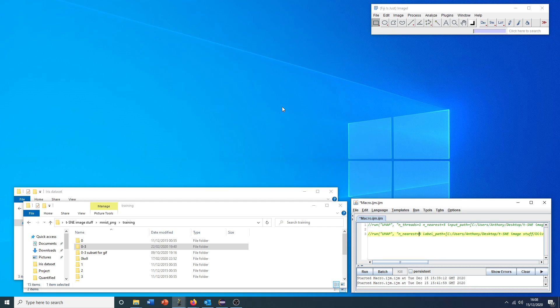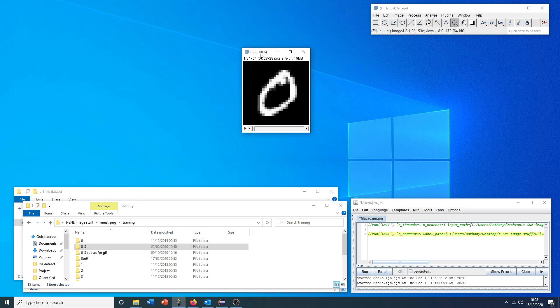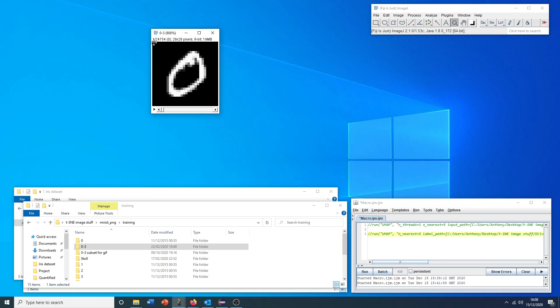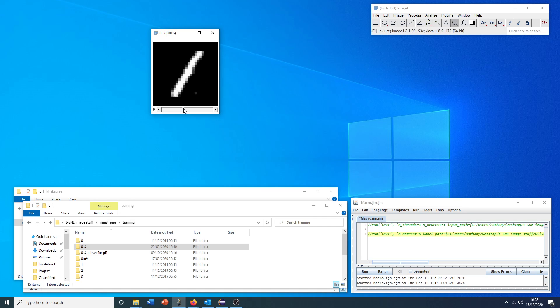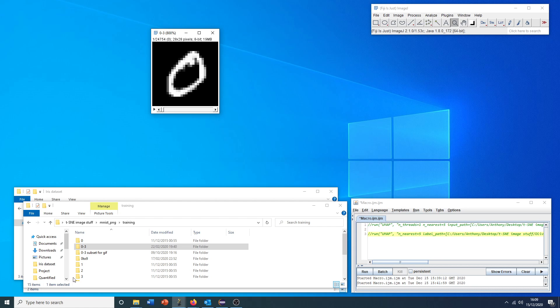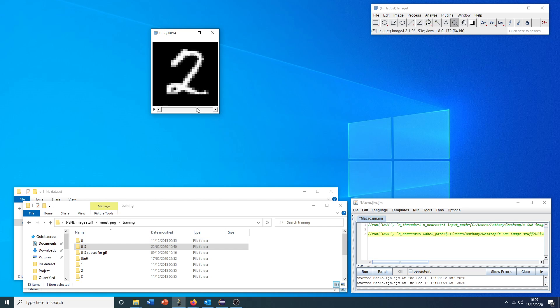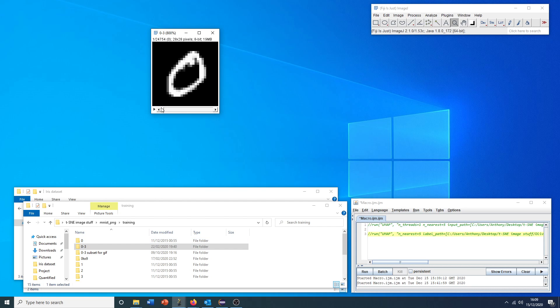This doesn't take very long. Here we are, on a modern computer it's already done. We have here our 28 by 28 pixel collection stack of hand-drawn numbers. They're sequentially presented here. That's just to do with the order they are in the folder. They don't have to be sequentially presented for the dimensionality reduction plugin to work on them.